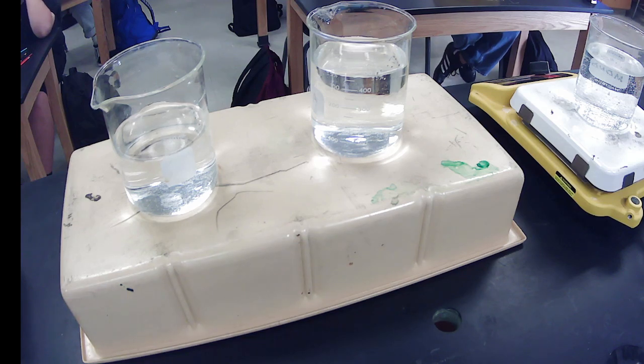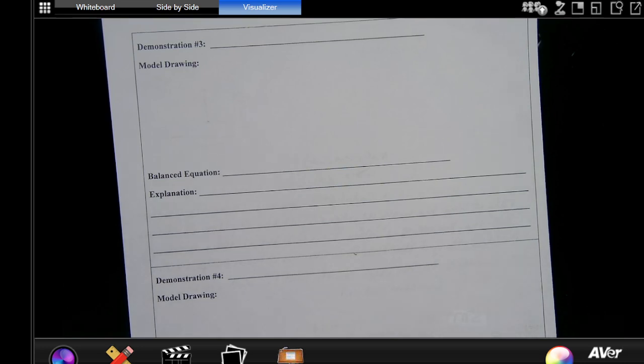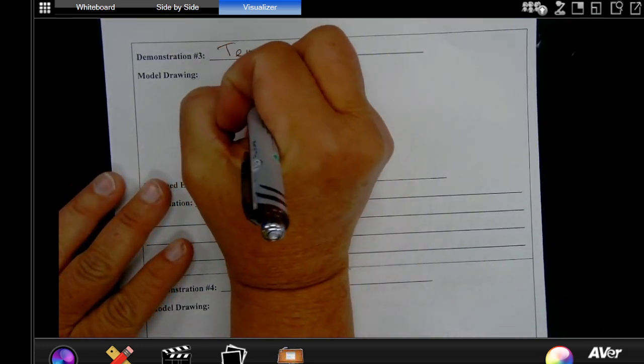There is a reaction within a glow stick. It's a little bit complicated. A glow stick has a lot of stuff in it. It's a very complicated equation, but I don't want you guys to focus on it too much. But we're going to write it just so you guys know. You don't have to memorize this. So we're going to see what temperature does.